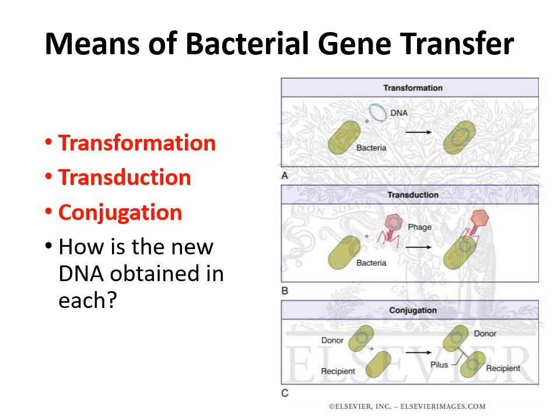The other form of gene transfer that you see on this slide that sounds a little similar is transduction. The difference with transduction is that the bacteria is still taking in new DNA, but the way it's doing it is by virus vector, meaning a virus injects new DNA into the bacteria.